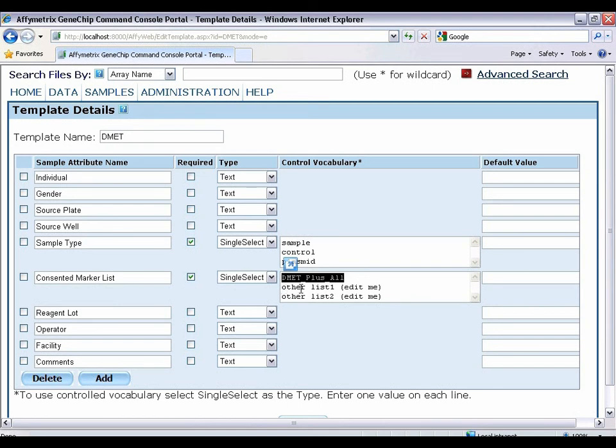For example, you can replace the second line other list one edit me with your own custom marker list name, save this template, and then use it when you batch register. Then in DMET console, import a marker list with exactly the same name, and at the point of genotyping, that consented marker list will be used.